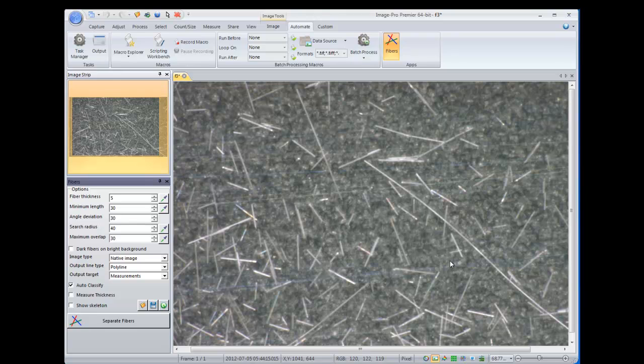Once you have the app installed and you open it up, you'll see that a dialog opens on the left, displaying all of your analysis options.